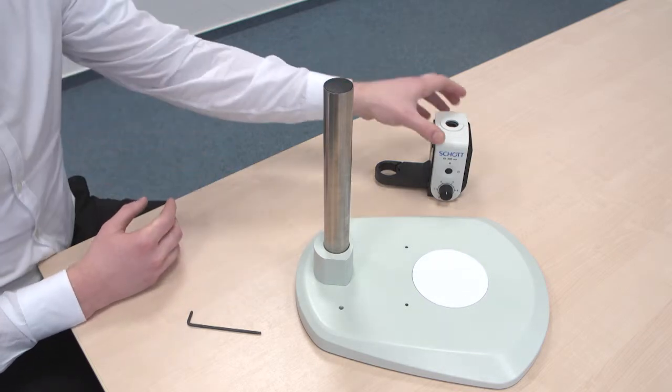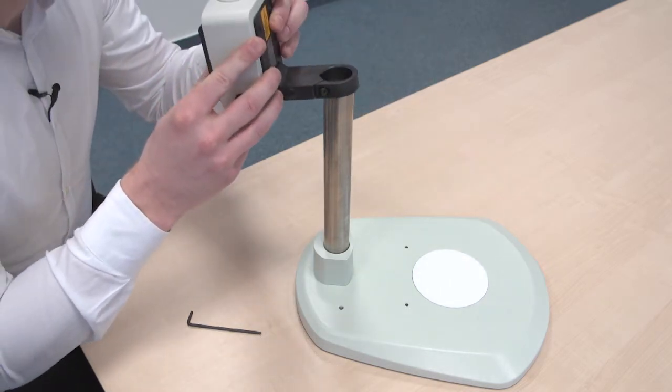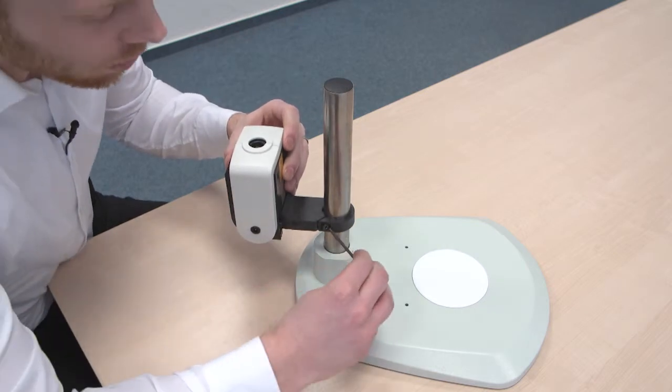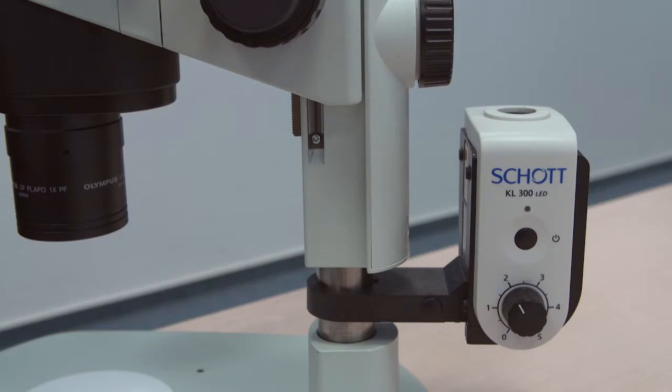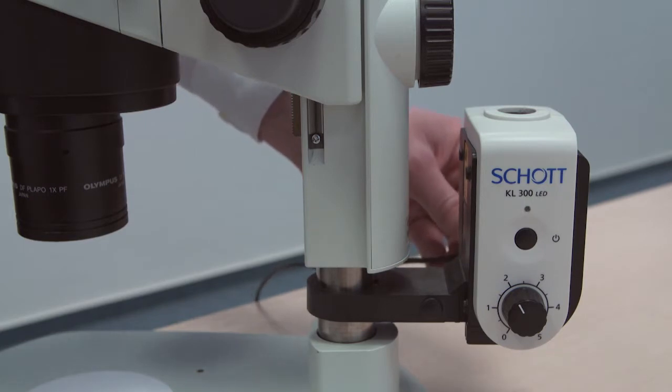Once you've done that, take the product, place it on top of the stand, then screw it tight with the Allen wrench. Now once you've reinstalled the microscope head, simply take the power supply and insert it into the KL300 LED.